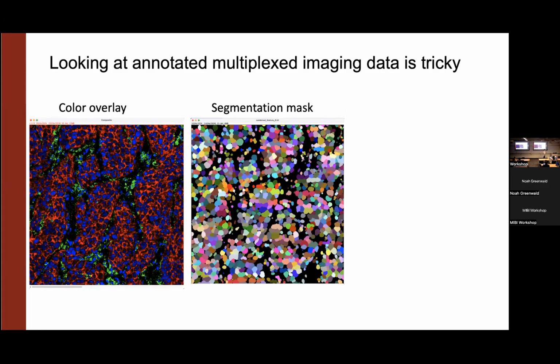like a segmentation mask? If you want to say, does this segmentation mask actually capture the shape of these cells? Maybe I have a bunch of different membrane markers, or I want to see if my weird squiggly looking macrophages are segmented. You want to overlay this segmentation on top of your image data. And the non-scientific image analysis, image viewers are not really built for this.